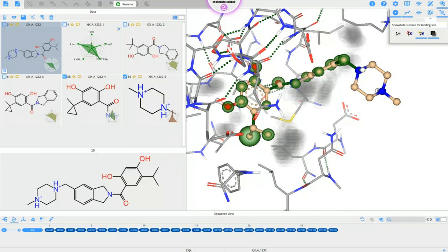And you see now the green area is showing you quite quickly how well the molecule fits your desired values. Some of the molecules here have red dots, which means the value of this property is over the range you like. So for example, here this has a higher molecular weight than what I was originally interested in. When you have a perfect molecule, you have a big, huge green area, which is perfectly filling out the areas that you wanted. This helps quite a lot when you have many molecules and want to find out which ones are of further interest to you.